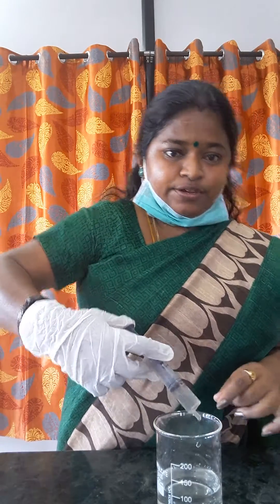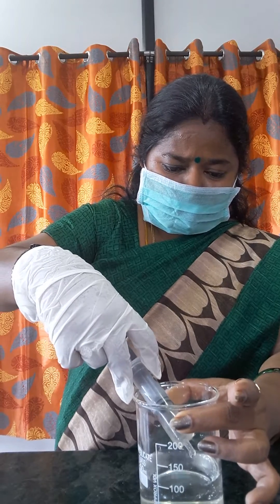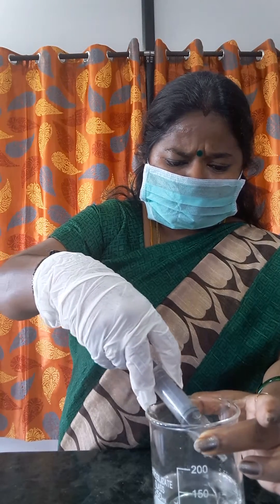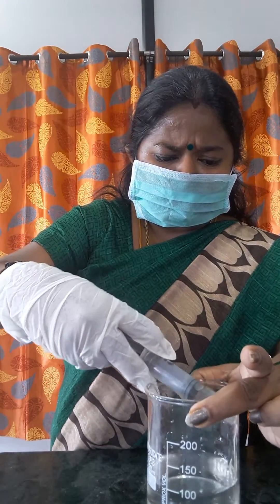We should not pour it all at once. We should add the sulfuric acid drop by drop along the sides of the beaker, like this. It is really dangerous to pour sulfuric acid into the water directly. Even you can hear some sound if you pour more. Along the sides only, like this.